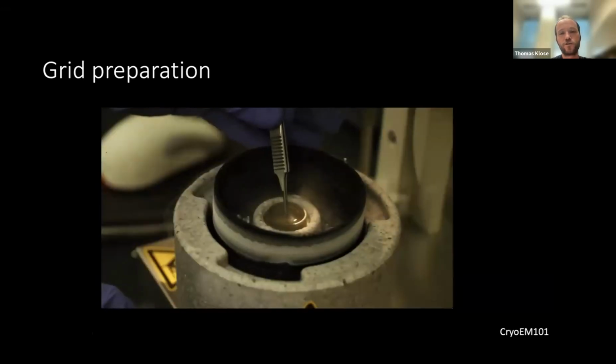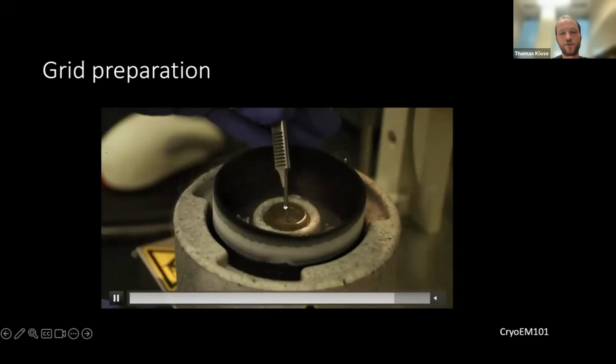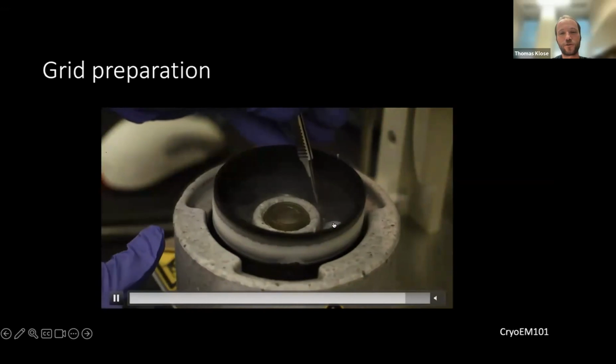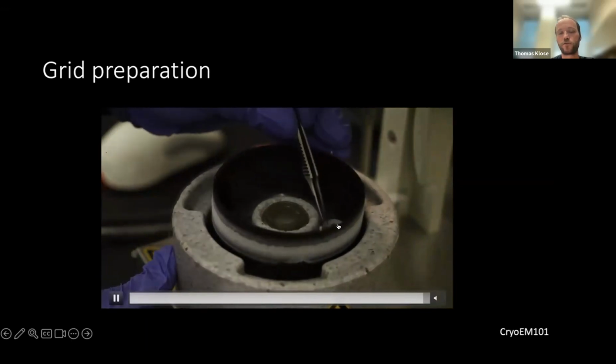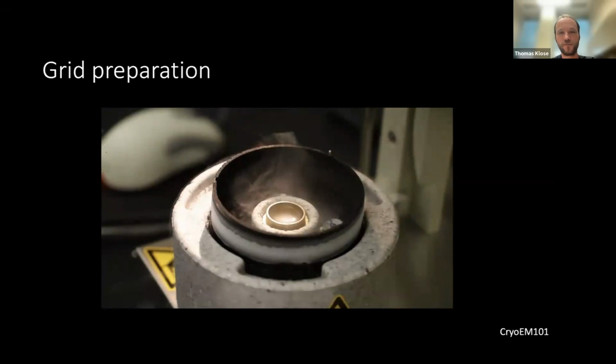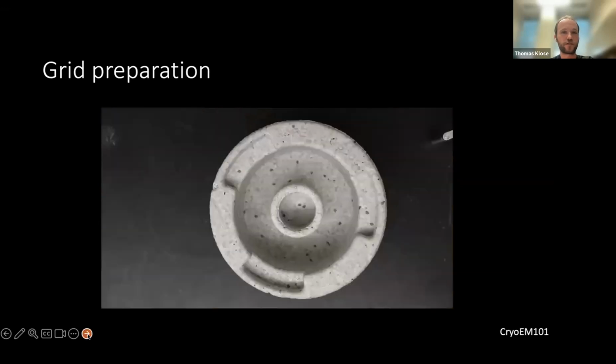And then the most challenging part is to get the tweezers out from the robot, transfer it into the liquid nitrogen, and then the sample gets moved into a grid storage container that can then be stored in liquid nitrogen for a long time if nothing goes wrong. Okay, so this is how this works in practice.